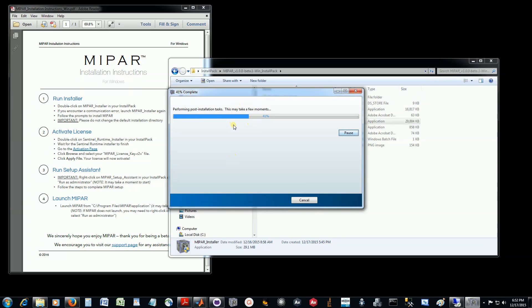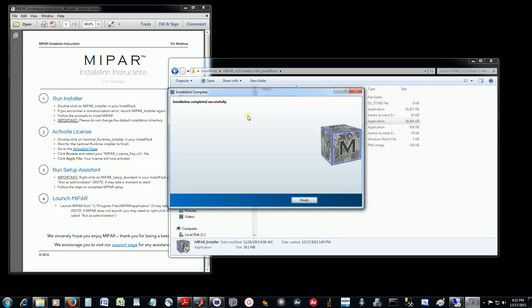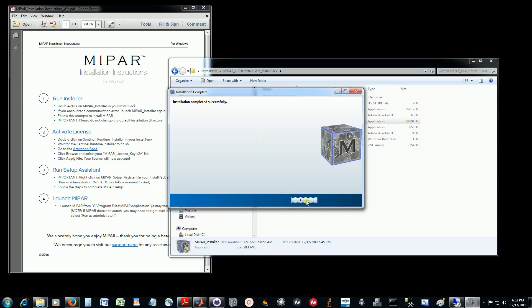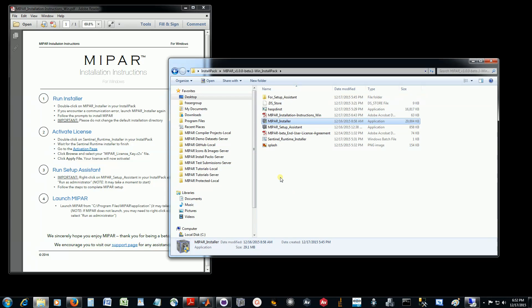Now I've already downloaded and installed the MATLAB runtime with a previous MyPAR installation, so this is skipping the download portion. Yours will download the runtime and then install it, and that may take a little while depending on your connection speed. So our installation is complete. This is the message you'll see as well. We'll just click finish.